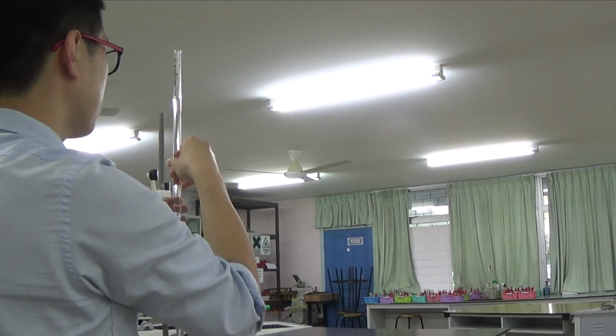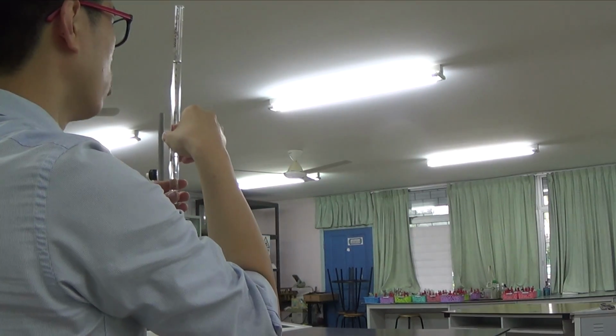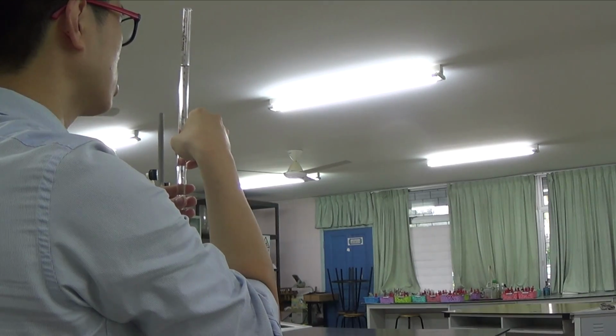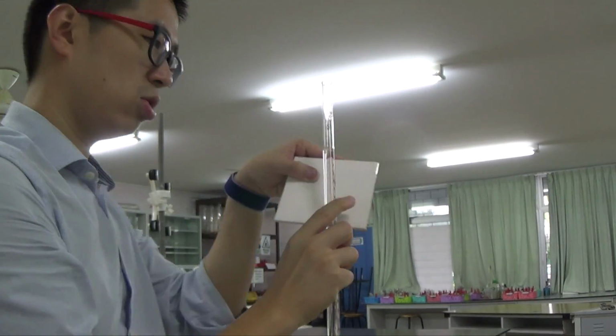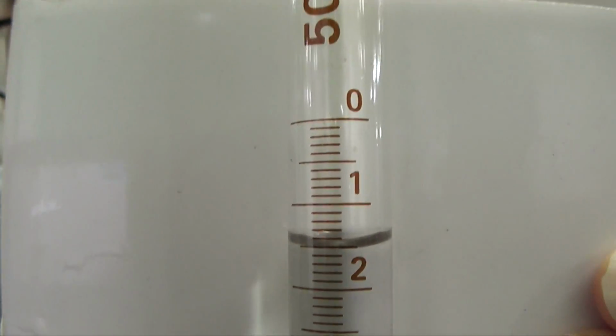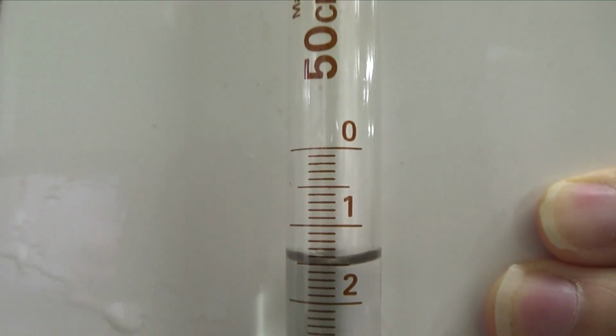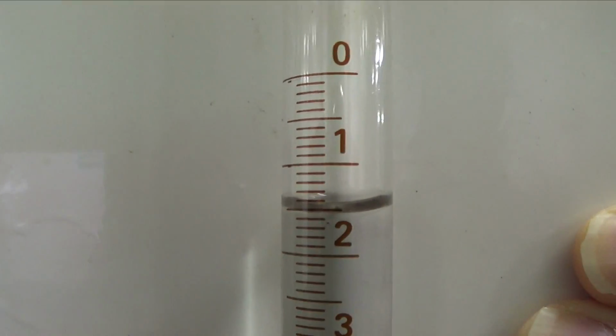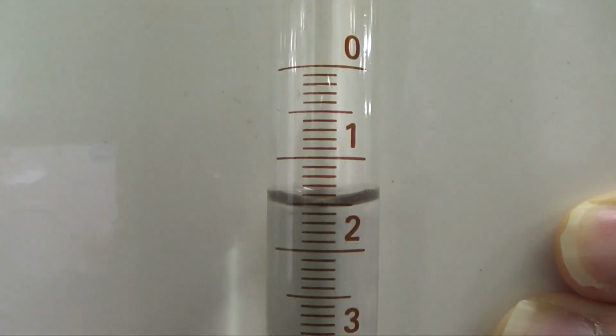My initial reading on the burette is to 1 decimal place. Reading below the meniscus, there's 1.6 cm cube. Just to convince you, there's 1.6 cm cube. You don't necessarily have to start from 0.0. You can start from anywhere, but of course your teacher might advise you to start from a number that's easy to count. I have my calculator. I'm an experienced chemist. I don't care where I start because I roughly know where to count it.